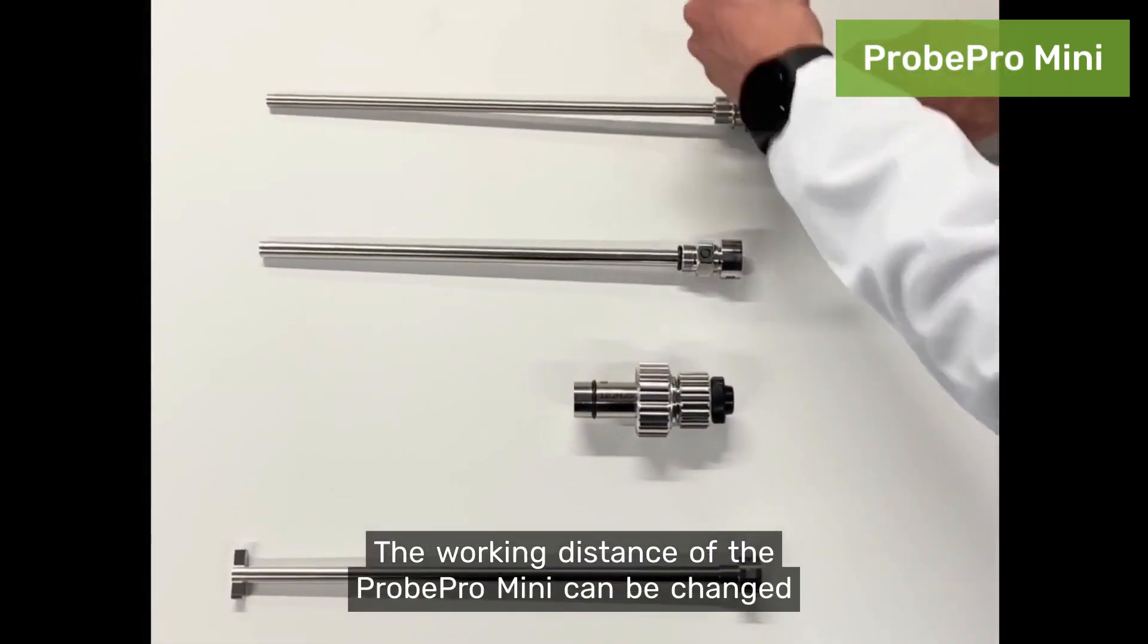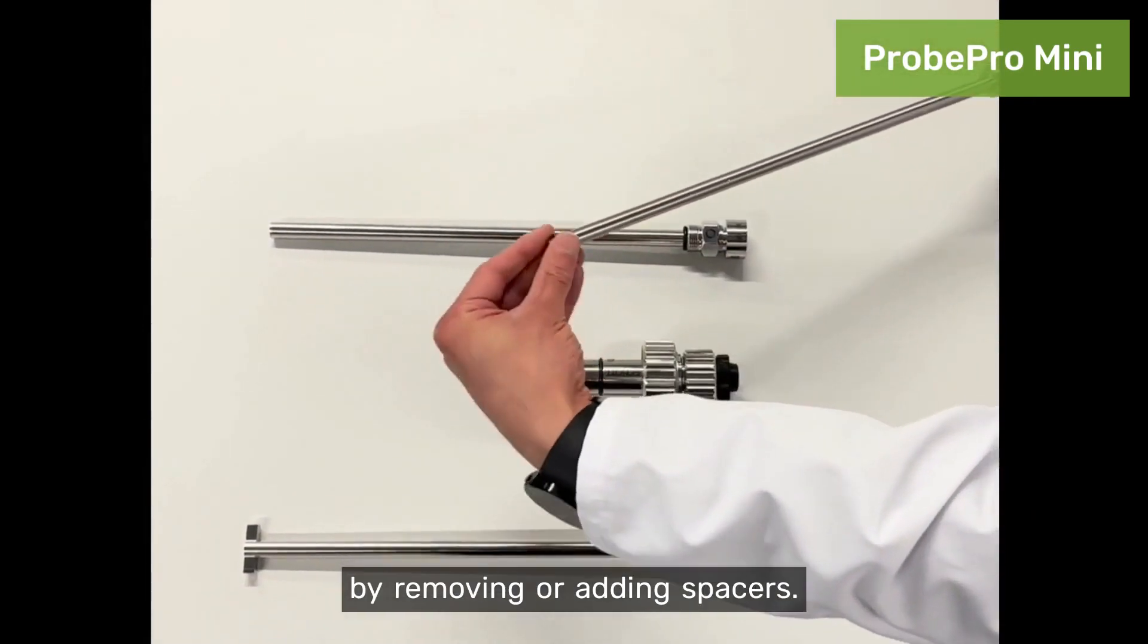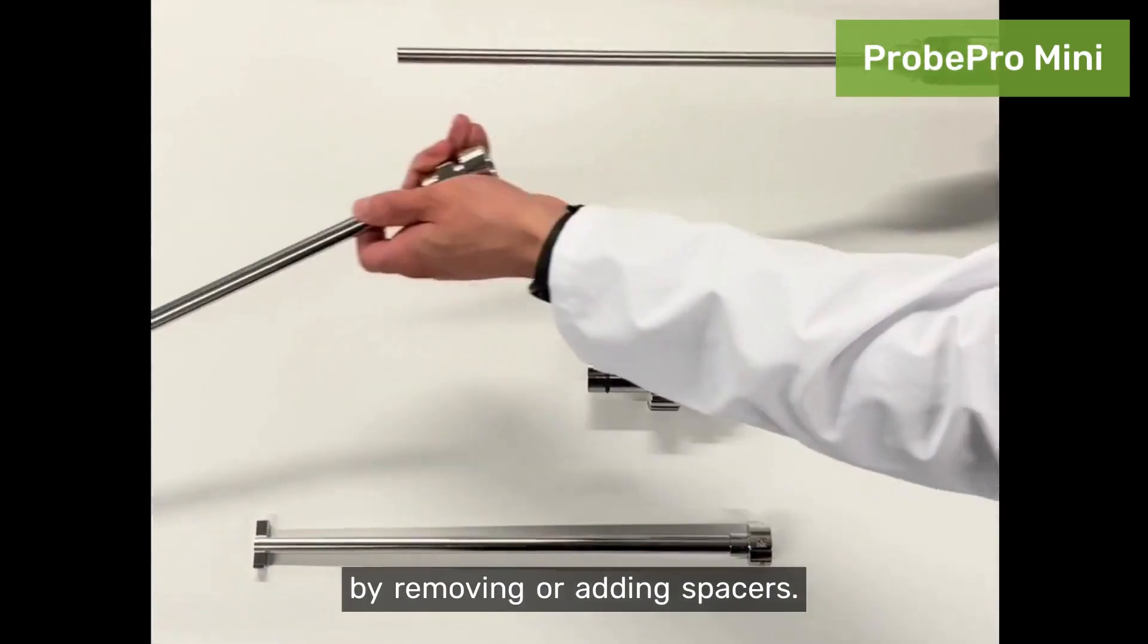The working distance of ProbePro Mini can be changed by removing or adding spacers.